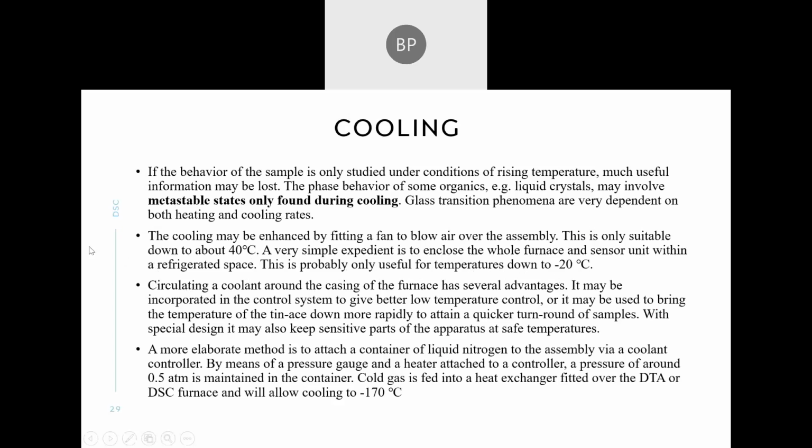So a new process came into evolution, and that is the process that is currently used: usage of coolant. This coolant is passed through the casing of the furnace in such a way that while traveling it takes out the heat from the sample and also the reference and the parts, and the heated coolant goes out of the casing.